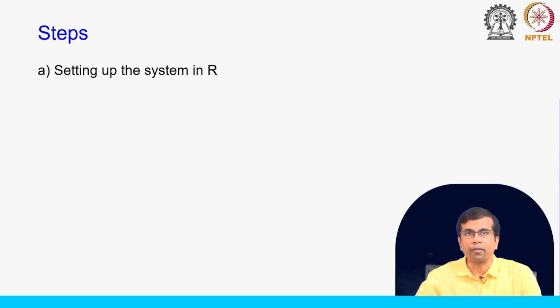So, just to remind you of all the steps, to summarize the steps. The first step is we have to set up the system in R. You might be familiar with R or might not. So, I will show you, at least very briefly, how to set up this system, where you will get all the tools, how to install the packages that are available in R, and how we can use these packages, where you get the manuals, all the details. Okay. So, this is the first part, right, we have to get the system running, right.